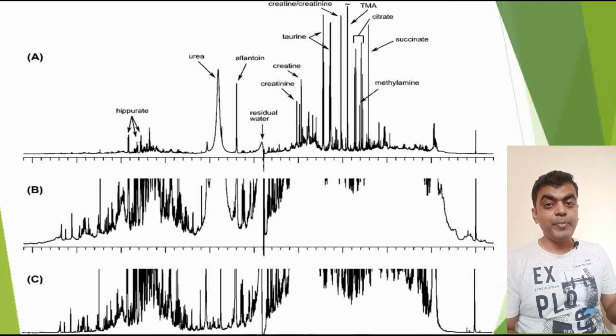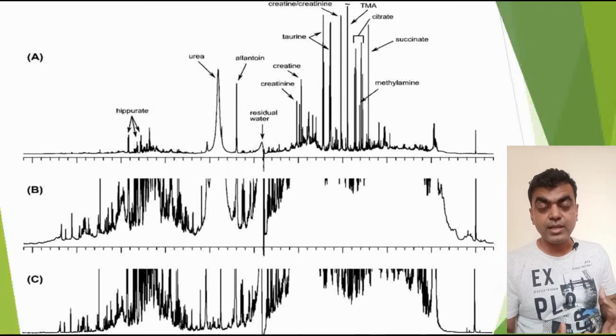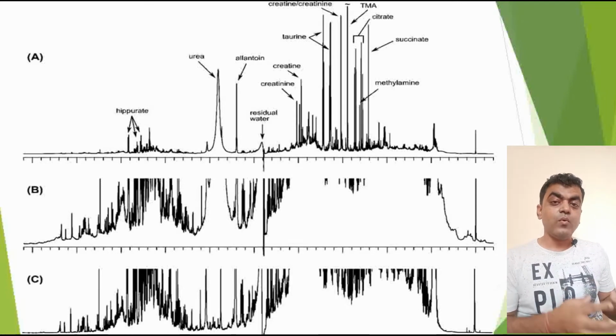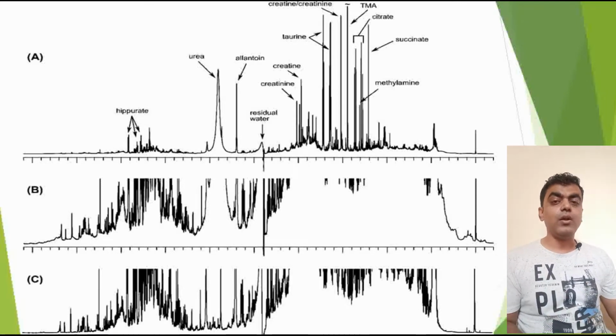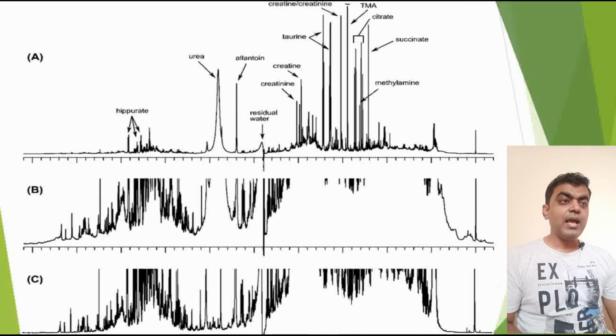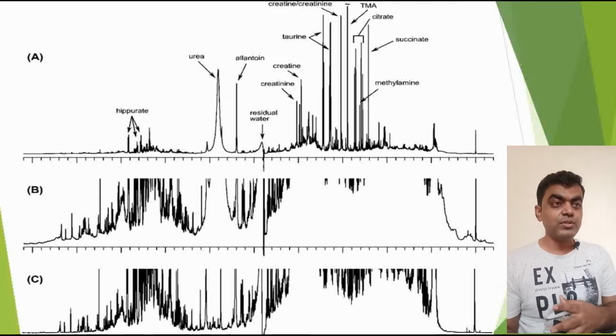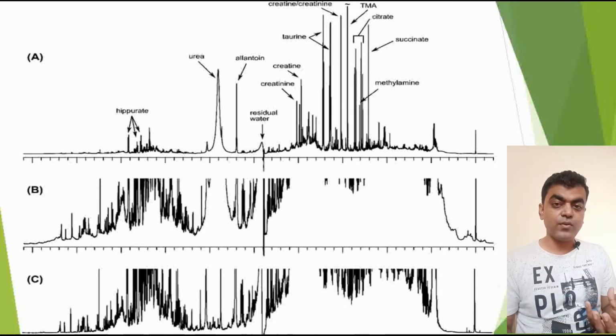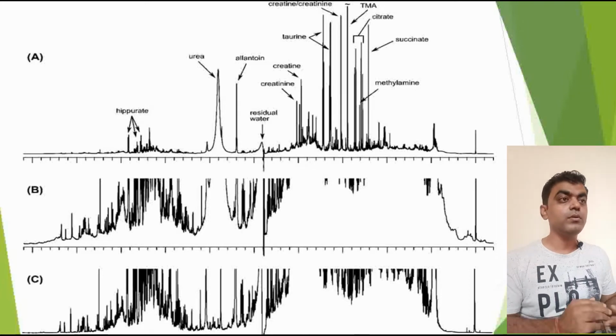But if you have lipids, fats, and at times complex oligosaccharides, in those cases you need to use a solvent in which it gets dissolved. There are a lot of solvents available, and you decide the choice of your solvent based on the sample you are going to study.